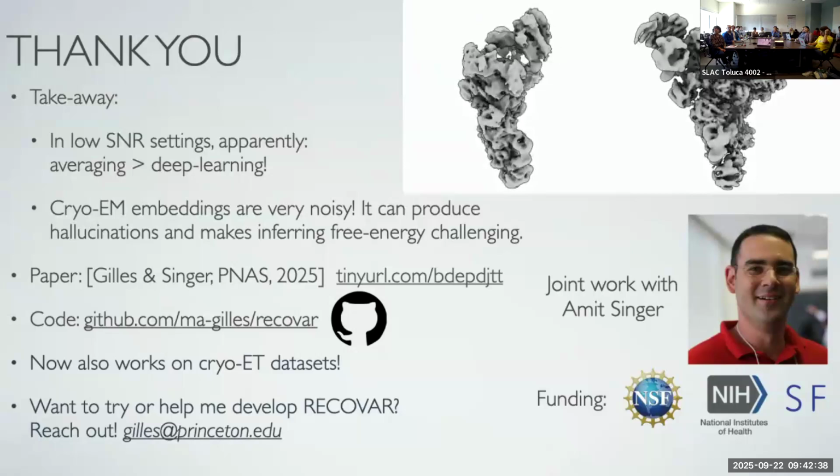And then, as you increase the size of the data set, you would feel that, of course there's more computation, but the results would get better. But in fact, they don't keep getting better. That's a feature of these methods, which is a little unfortunate: most methods, including mine, are not consistent. As n goes to infinity, the number of images goes to infinity, they don't keep improving. So there's a limit there to current methods, at least.